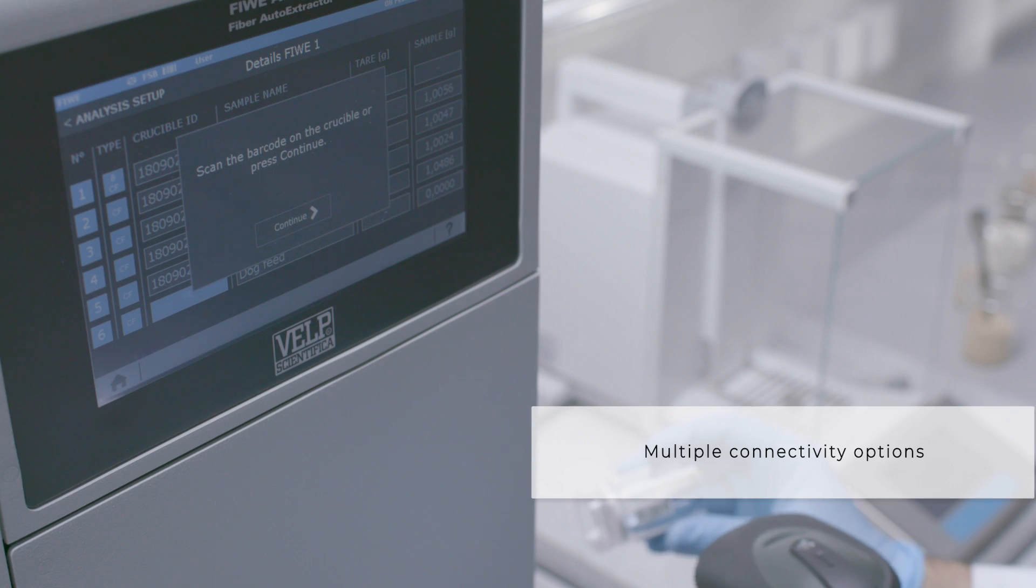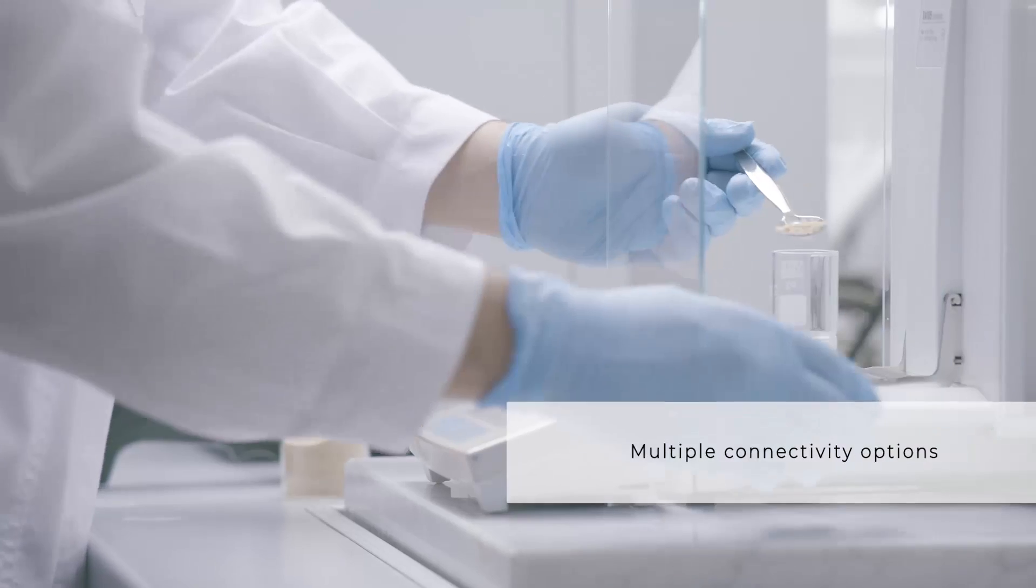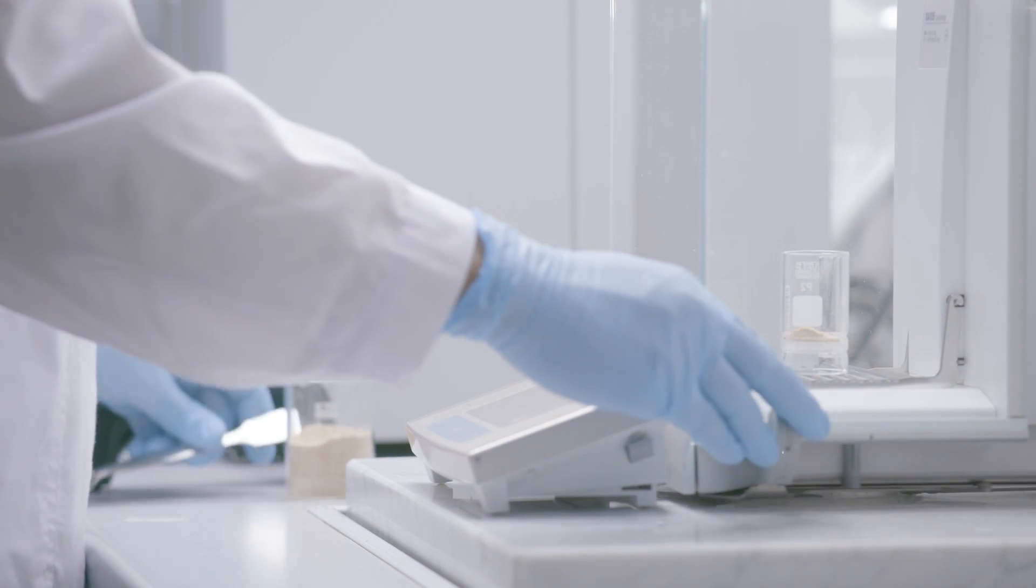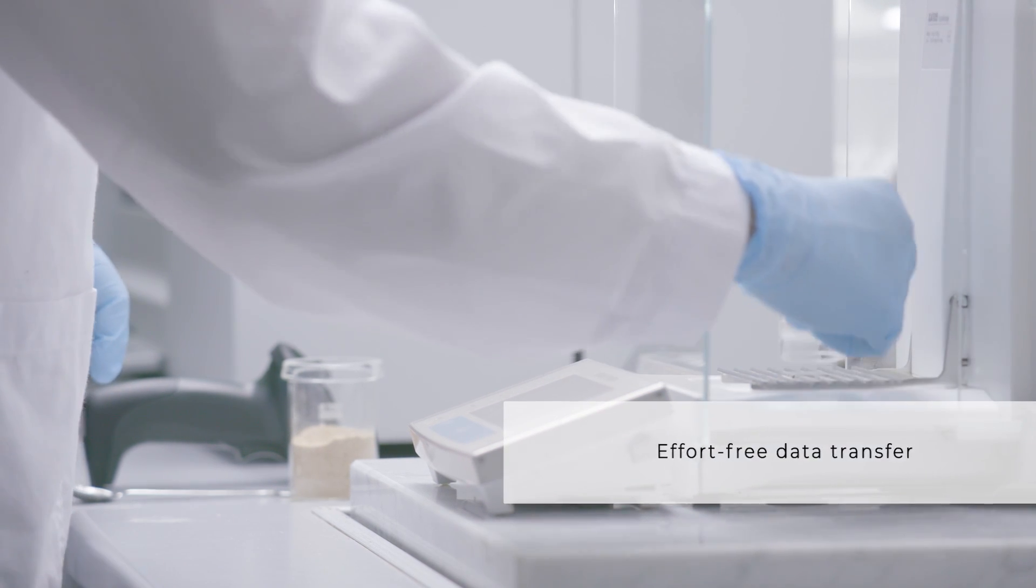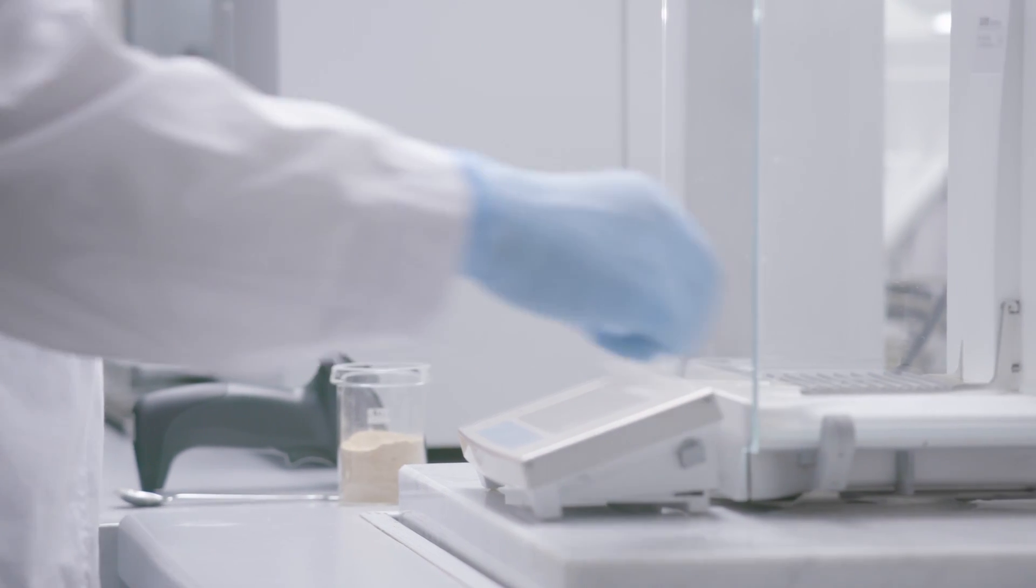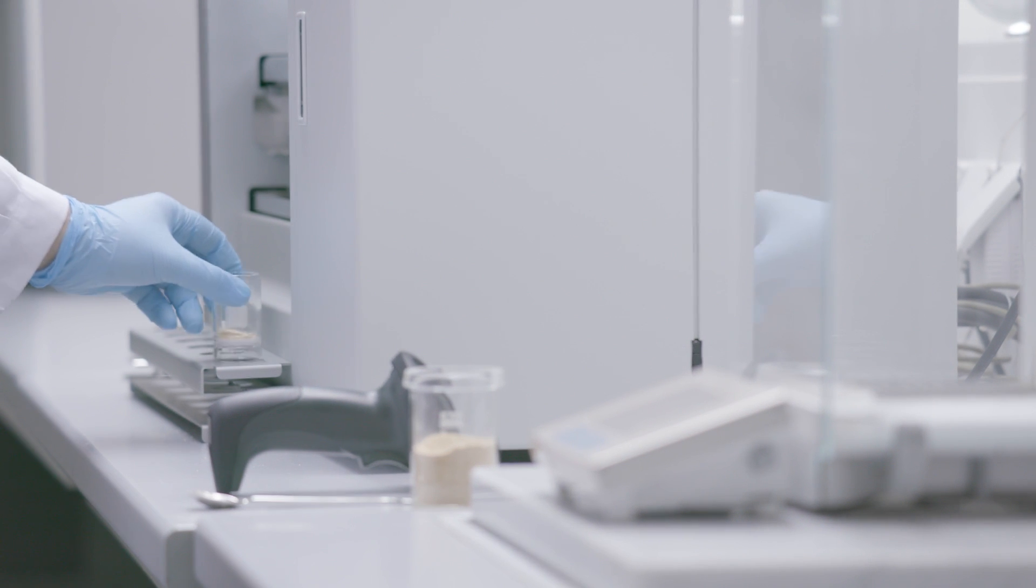Feeway Advance multiple connectivity options allow you to transfer data from the balance to the analyzer, avoiding manual transcription errors. The VELP barcode technology expedites data collection.